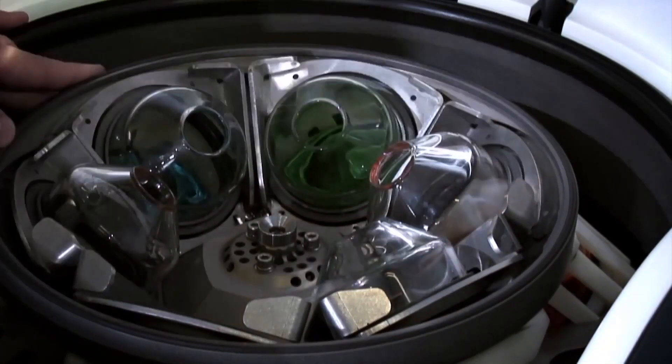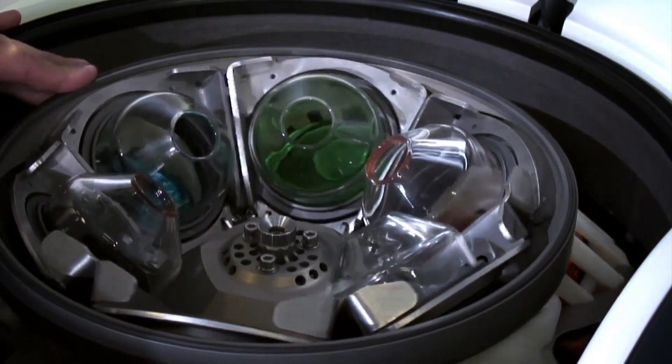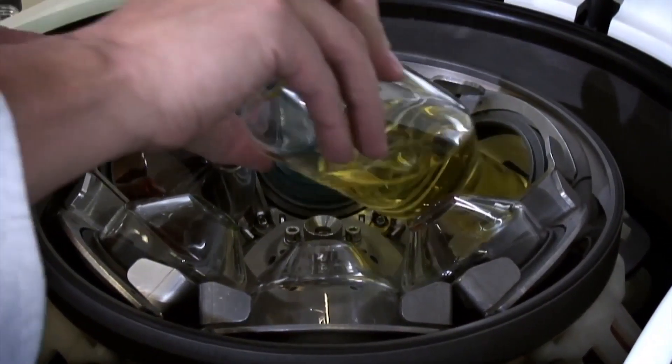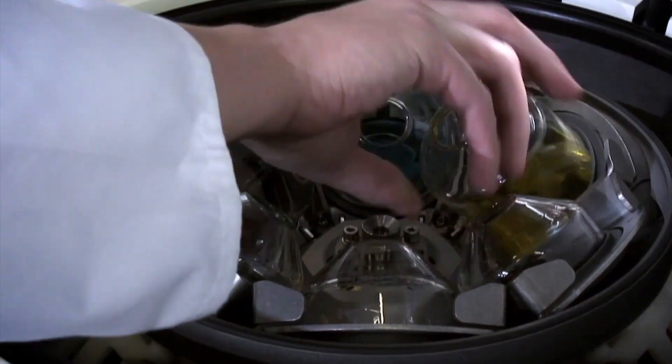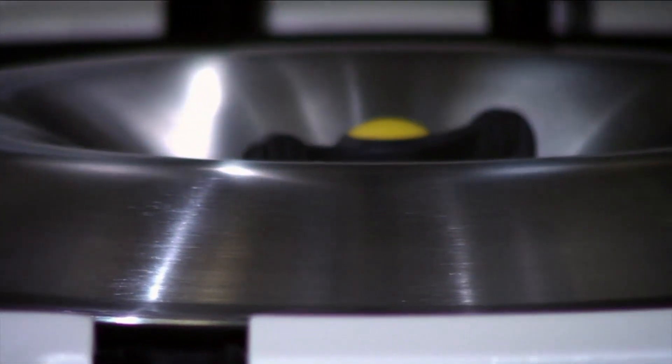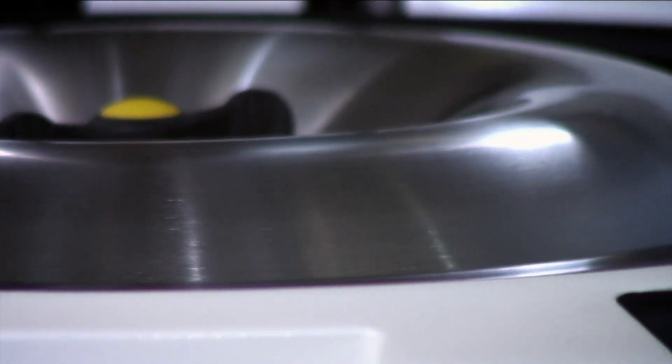When fitted with a removable six-position flask rotor, the rocket synergy will accept up to six flasks with a working volume of 400 millilitres or up to 18 ASE tubes with options to optimize sample transfer.